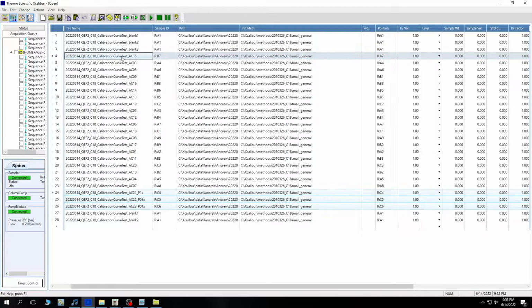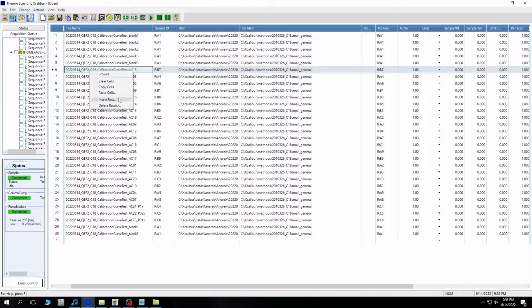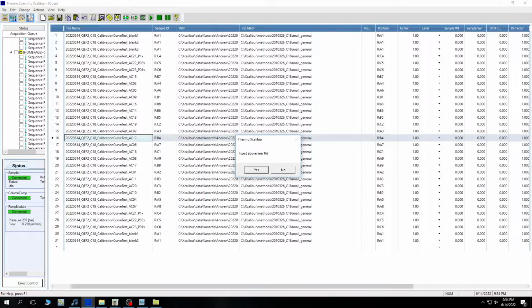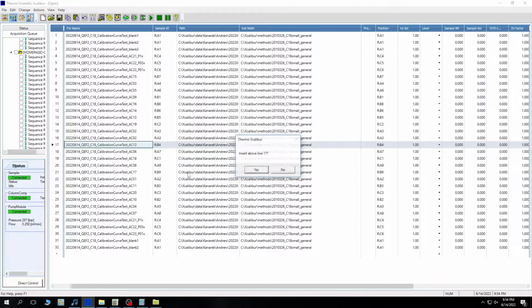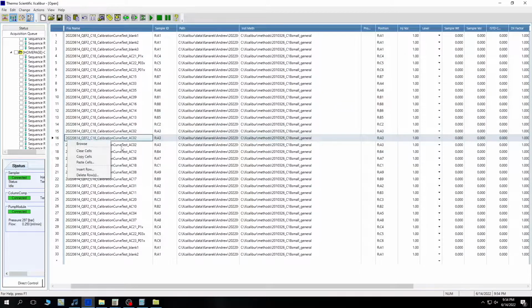And then we'll insert a few more here. And just speed things up again. Yeah, inserting some more to create space there. It will create an additional one of the cell above. And then you paste those in there, double check that all the cells are being filled properly. And we inject pools multiple times for QC purposes, and we'll inject, if we can, P1X and O1X in the middle every 8 to 10 samples. So I'll insert new rows, just copies the ones above, and then you can override them.